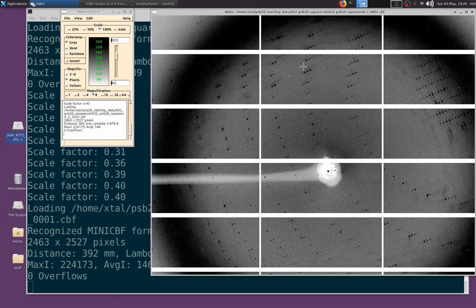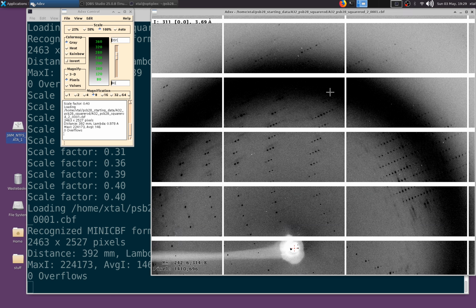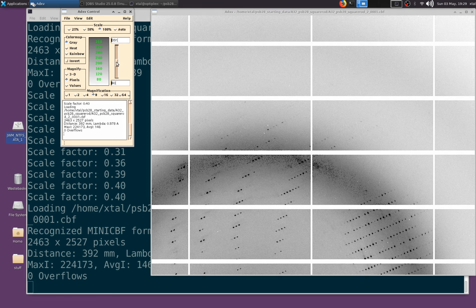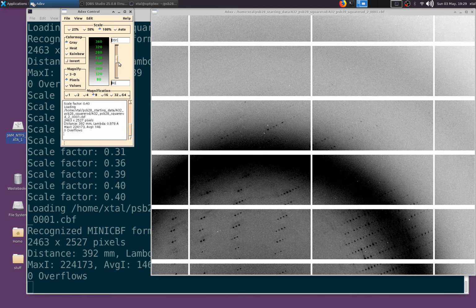The other thing is you need to adjust the scale, because a typical screen has only about 1,000 levels of grey, whereas this image is recorded probably in 16 bits, which is 32,000 or 64,000 levels of grey. So the structure in the image is more than you can actually see, so you need to adjust the scale to see, say, a spot here better.